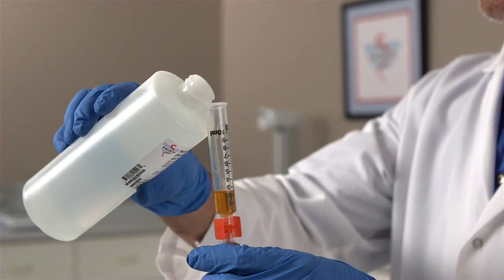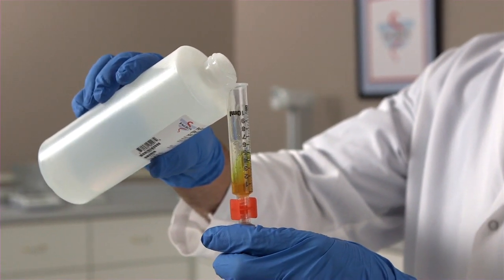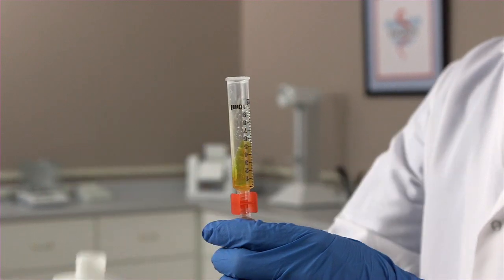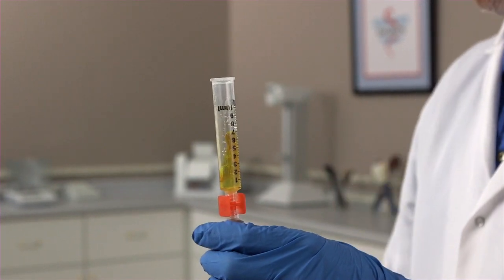The last step is to add the Paloxamer 20% gel to the 10 ml mark on your luer lock syringe.